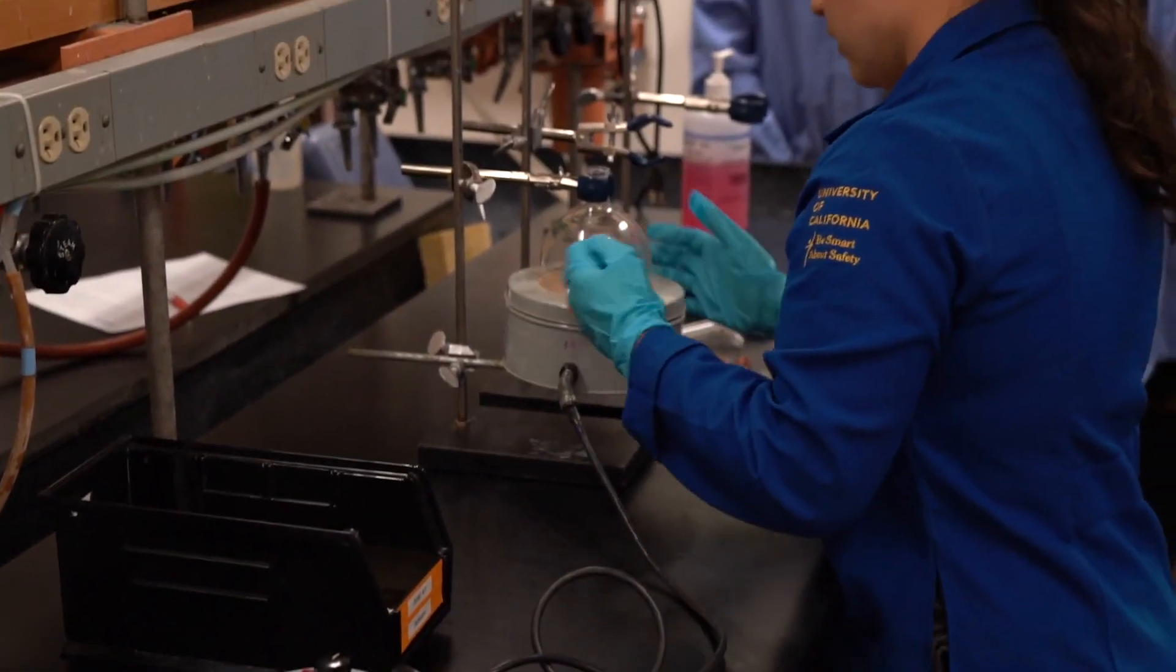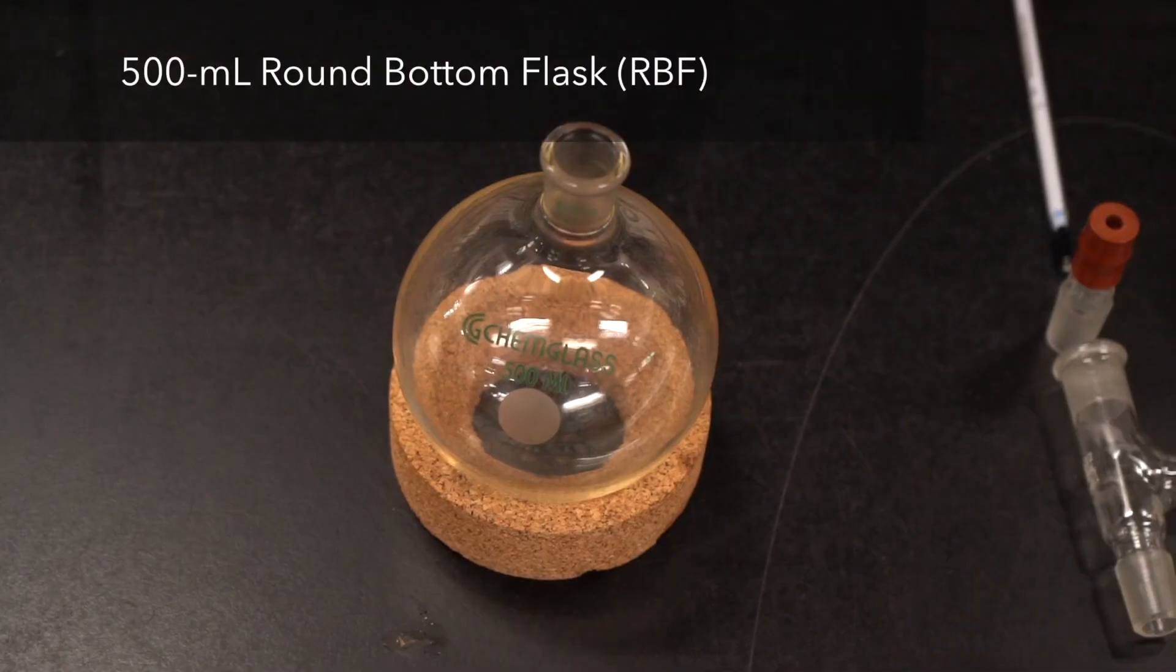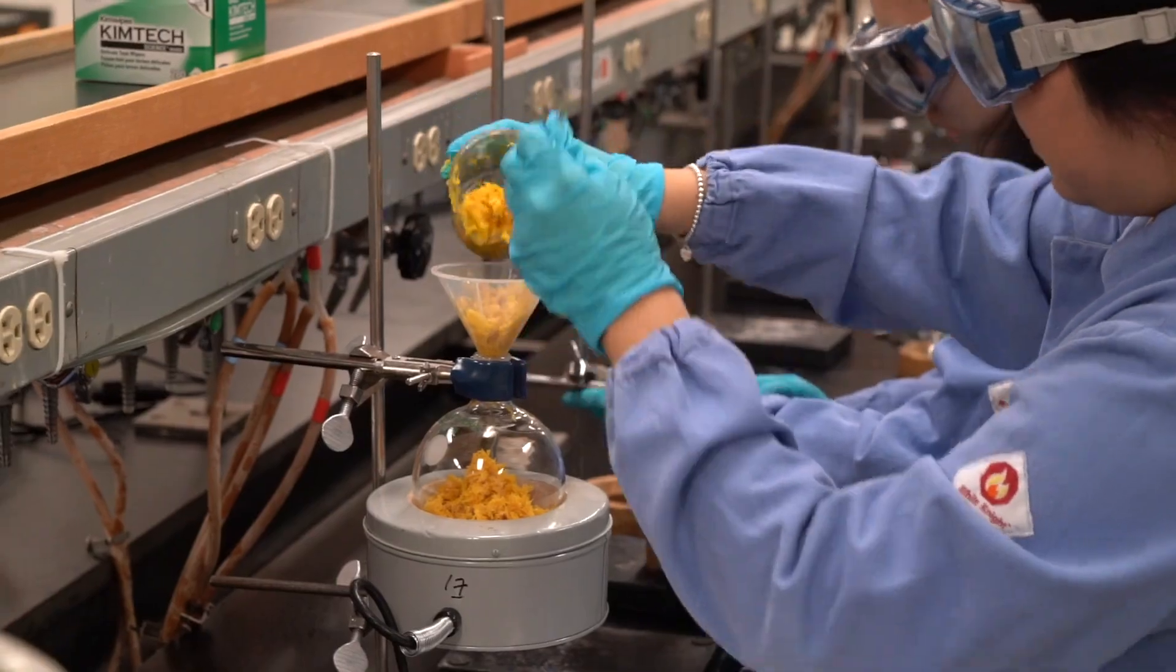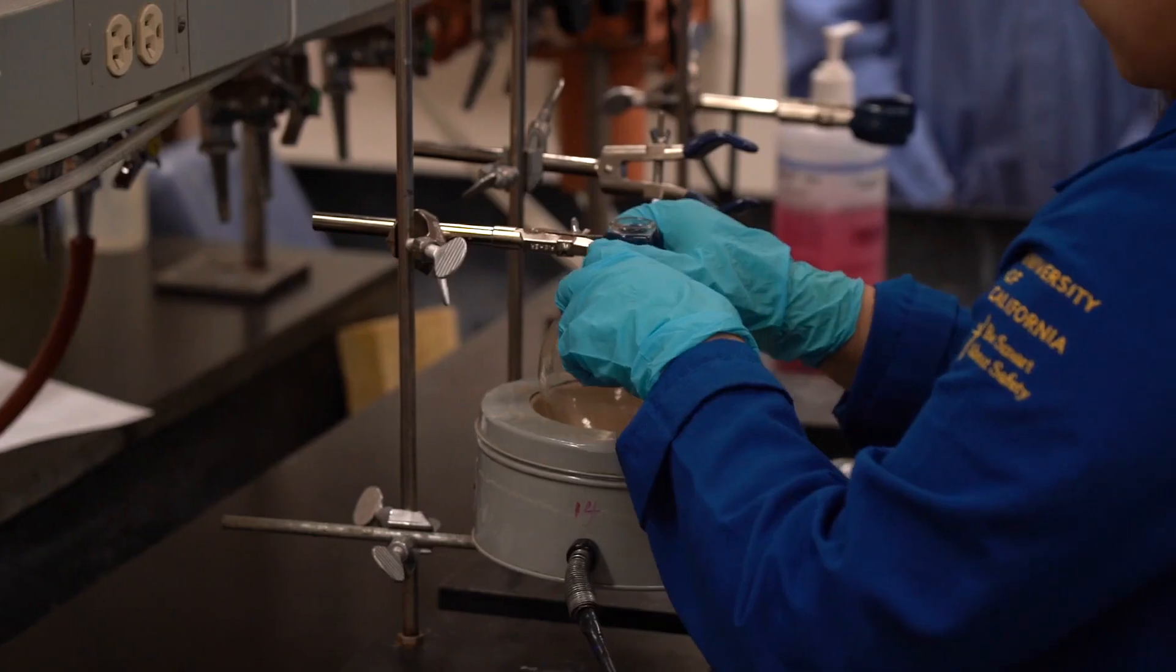Then you're going to attach your 500ml round bottom flask. You want to add in beforehand your water and your citrus peel. Clamp it.